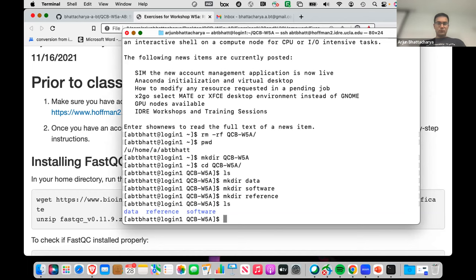So the biggest error that trips up people when they're starting out with running things on the command line is that they forget where they are in the file structure, and where their objects are and where they're pointing to it. Okay, so.